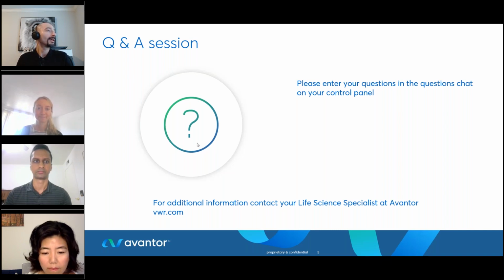Great, thank you. So maybe either Aaron or Sarah, both of you can contribute to this question. What is the best way to determine if my plasmid is a dimer? I guess that can be both a wet lab or bioinformatics solution. Sure. From a bioinformatics perspective, you just do the assembly as normal, so do the workflow as normal.